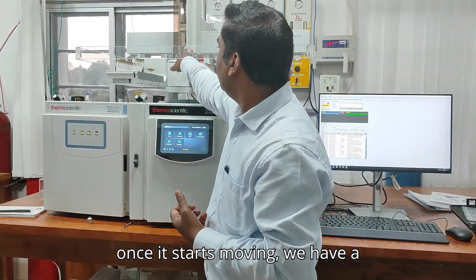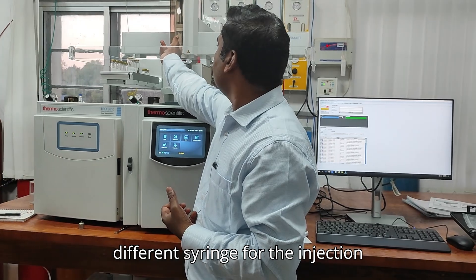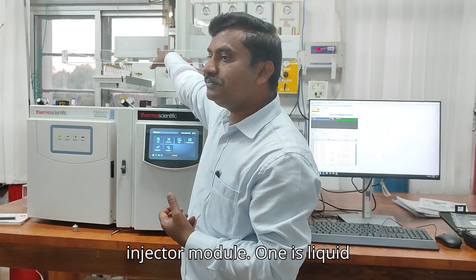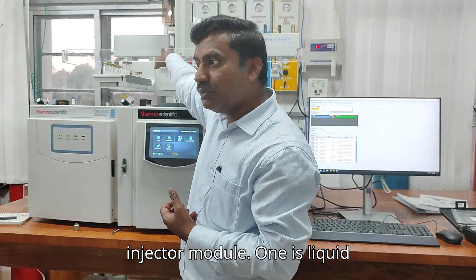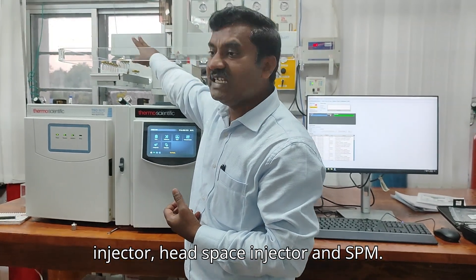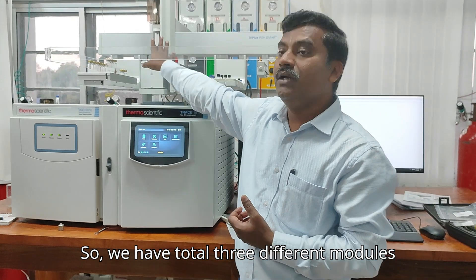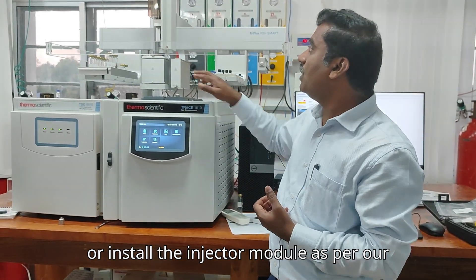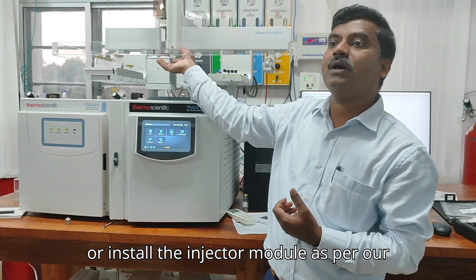Once it starts moving, we have a different syringe for the injection module — you can call it the injector module. One is a liquid injector, one is a headspace injector, and one is SPME. So we have a total of three different modules here.